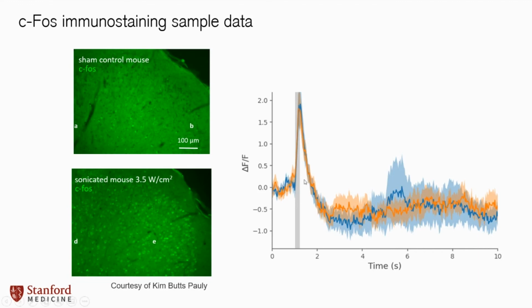Like they are responding. But after I stimulate, you can see this refractory drop in neural activity. And at least for this experiment, it goes on for quite a little bit. It's well beyond 10 seconds. So if I summed up what's happening over this window, I may get a net zero excitation. I may get more, I may get less. It's really a little bit of a black box. But because c-Fos is an aggregate over this window, I may miss entirely what's happening.